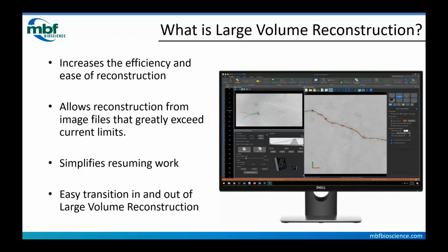One of the developers used an analogy that I'll just see if this helps. He reflected that this is similar to eating a pie. You could eat the pie all in one sitting, or you could take smaller, more deliberate bites and actually be in more control over each individual bite.